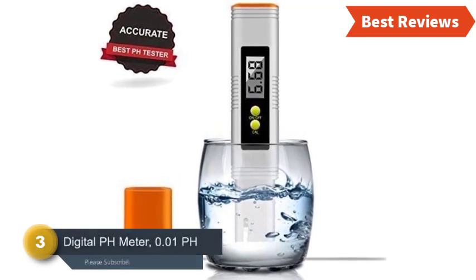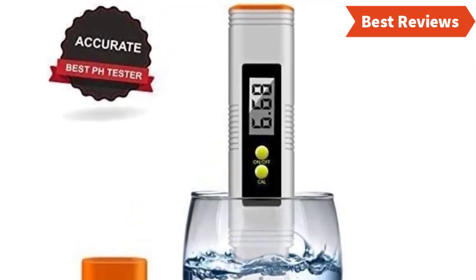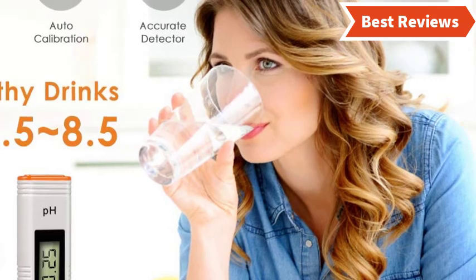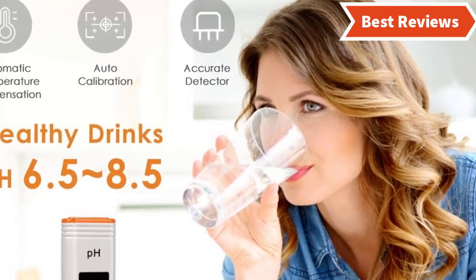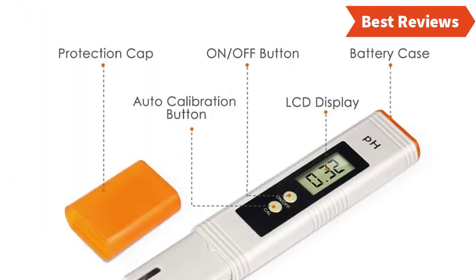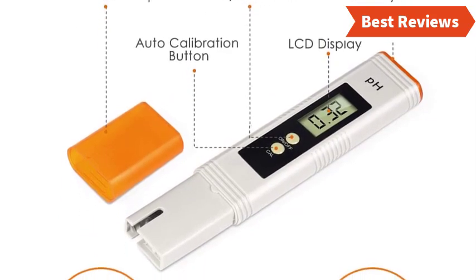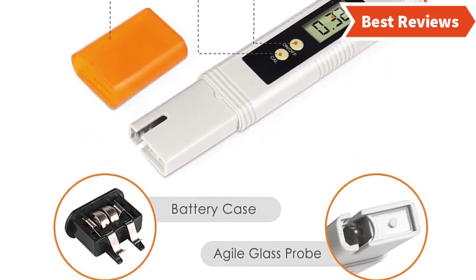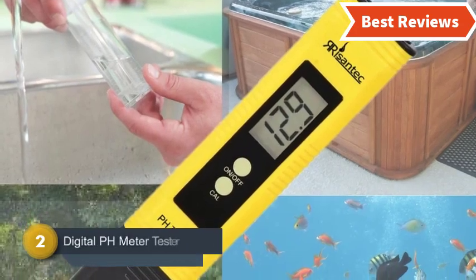Item number three is the Digital pH Meter 0.01 pH, one of the best pH meters for multiple uses. Key features include automatic temperature compensation, auto calibration, and an accurate detector. This pocket device can easily test pH in ponds, saltwater tanks, and aquariums. Its simple design makes it easy to use even for beginners. There are on/off and auto calibration buttons for easy access, an easy-to-read LCD display, a battery case at the top, and a protection clip at the bottom.